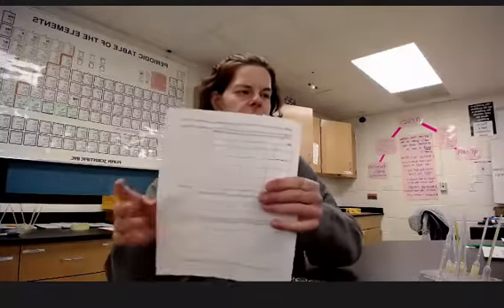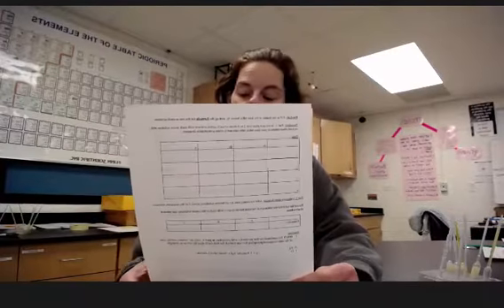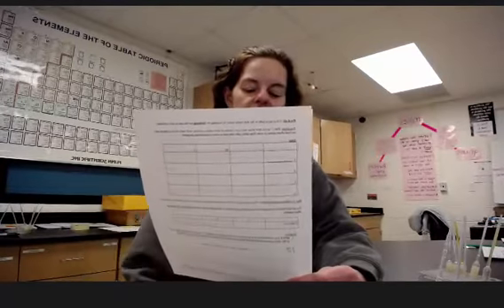Okay. I set up a data table for you already, so you just have to fill that in as you go. Notice where it says here A, B, C, 1, 2, 3, 4, you're going to put the formulas for the ions. So for example, A is silver 1, so you would write Ag+ because silver is Ag and 1 means it's plus 1. So that's what you'll do. Go through and write those in, the formulas for the cations and the anions. If you're not sure, remember there's a list of polyatomic ions on the back of your periodic table.